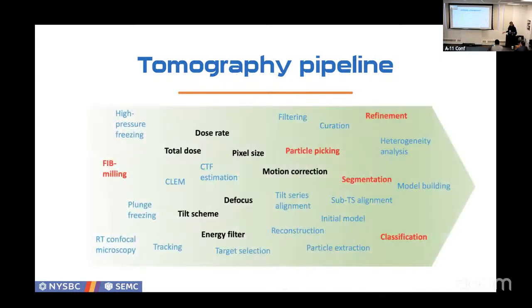This is sort of the settings you have to keep in mind. I kind of arranged them from sample prep all the way to data processing. It's not exhaustive. And what you see in the end in black is what I consider kind of figured out. We know what we're doing. And any staff scientist here who does tomography can answer the questions about these things. Blue is, we know how to do it, but there are a lot of variables.